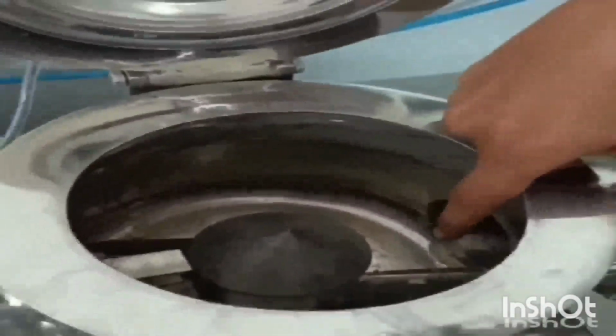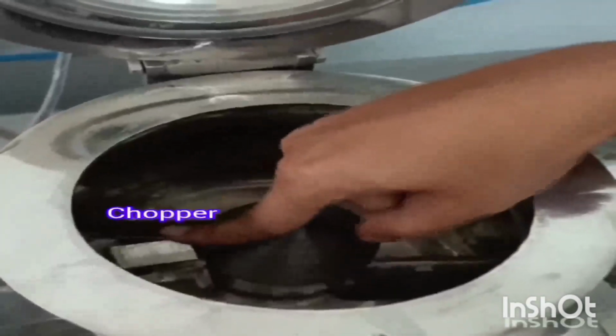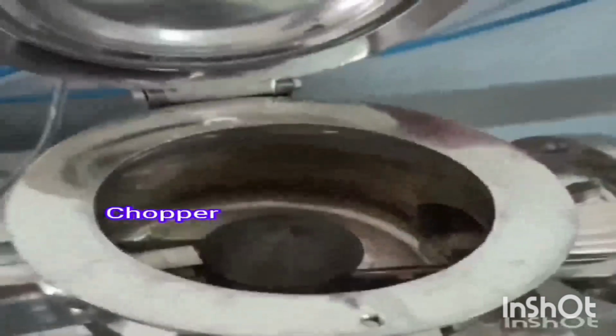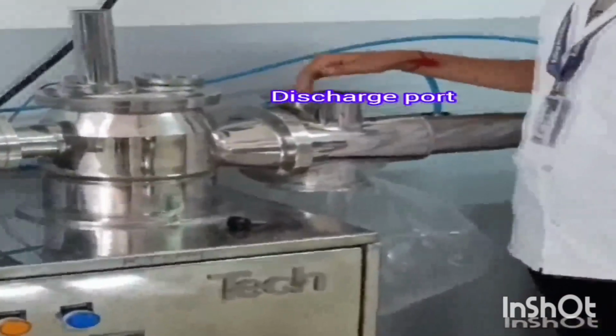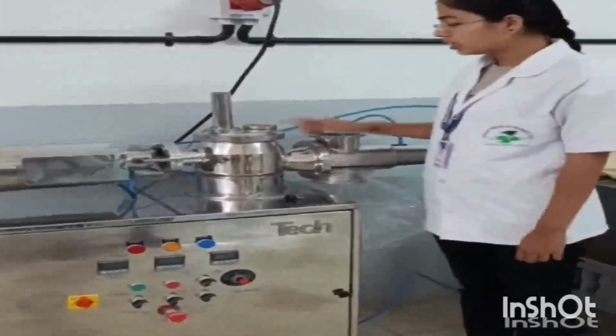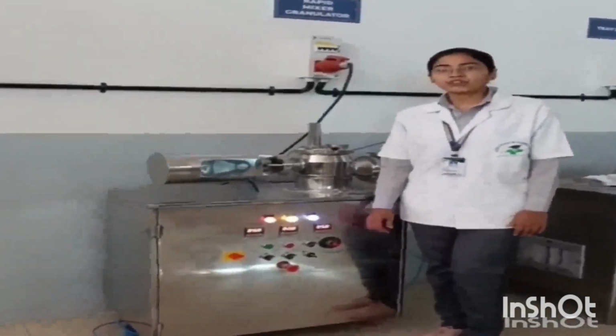In this mixing chamber there are two blades present. First is the impeller blade, which is used for homogeneous mixing of all ingredients. This is the chopper blade, which is used to break down the larger particles into granules. Then this is the discharge port, where ejection of the prepared granules takes place into this collecting bag. A pneumatic system is present for cleaning the impeller and chopper blade by using air filtration. We are going to set the time for preparation of granules.